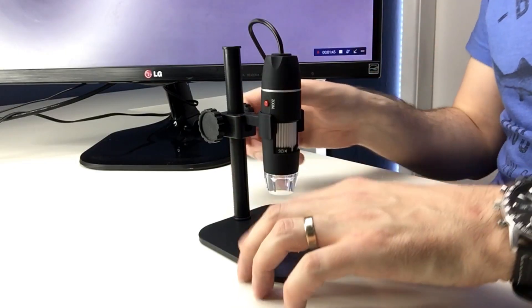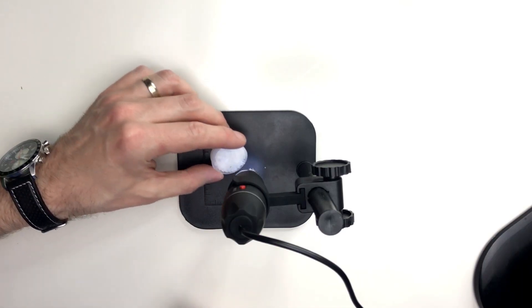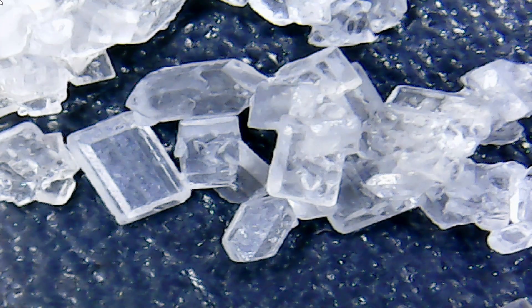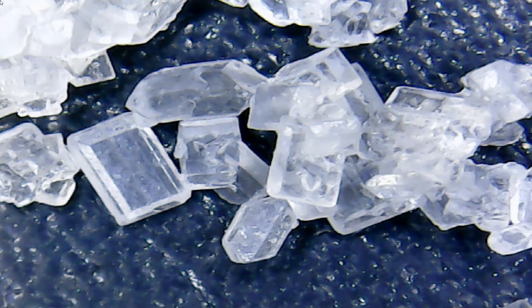We're going to try it out and I've got some interesting things to look at. So this is sugar — I'm going to pour some of that in there — and we're now going to try and adjust to try and find what sugar looks like under the microscope. Whoa, look at that! Those are individual grains of sugar, and as you can see they look like huge ice boulders almost. That is pretty amazing.